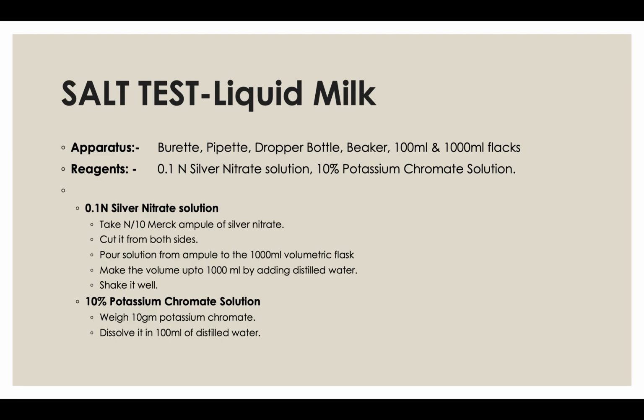For this, we need a burette, pipette, dropper bottle, beaker, 1 beaker of 100 ml and a 1000 ml flask. For this test, two chemical reagents are required: 0.1 normal silver nitrate solution and 10% potassium chromate solution.